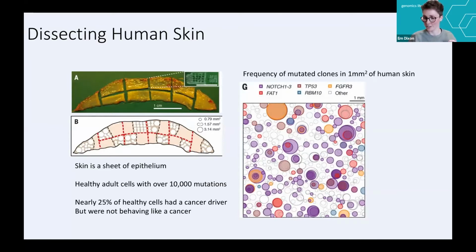The other question that was very specific to what you were talking about, someone's asked whether you can use the LCM, the laser method, for prognostic studies, and how feasible would that be? So that's what we're trying to develop at the moment, a technique of using this to study and identify disease before it happens. Part of that was slightly complicated from these findings in the skin, where we found that DNA mutations and driver genes could occur in healthy cells.